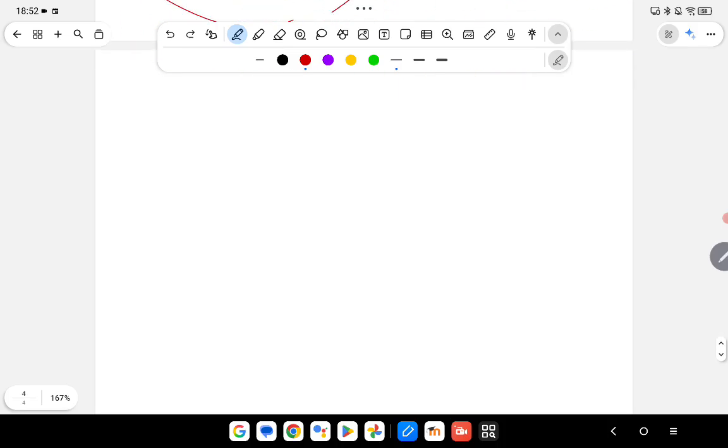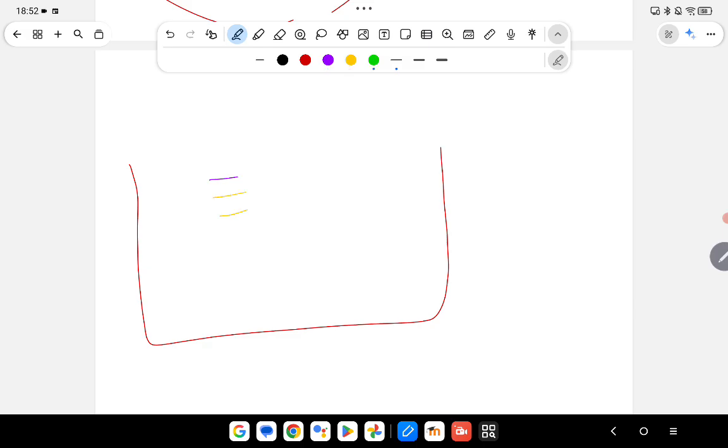All right. So next concept I want to go over is the kaleidoscope. Okay, so you remember in that gel you had one well where it was multiple colors? Something like this, right? Very pretty.